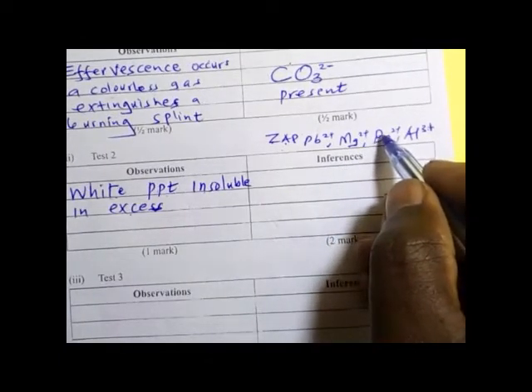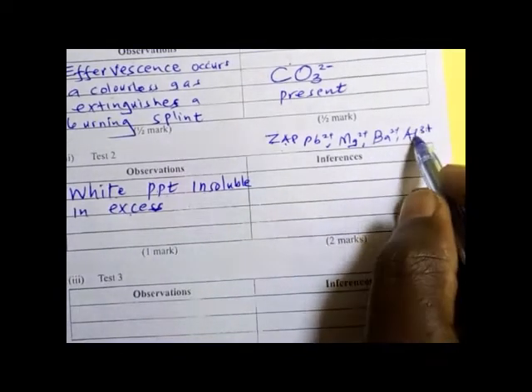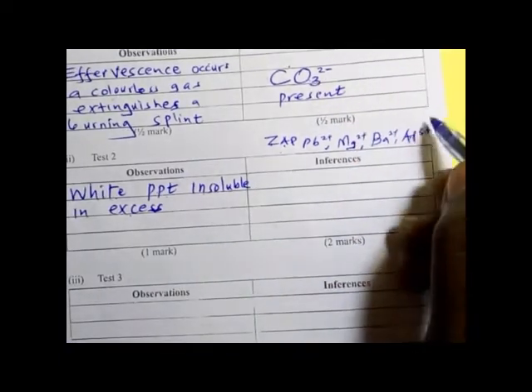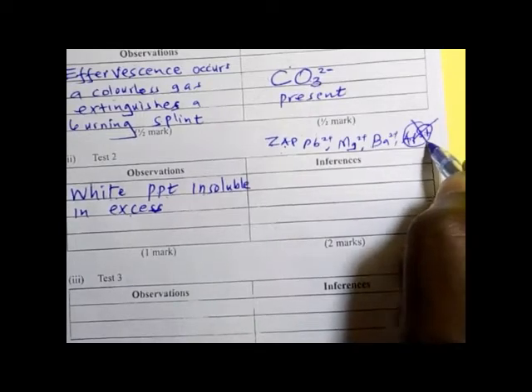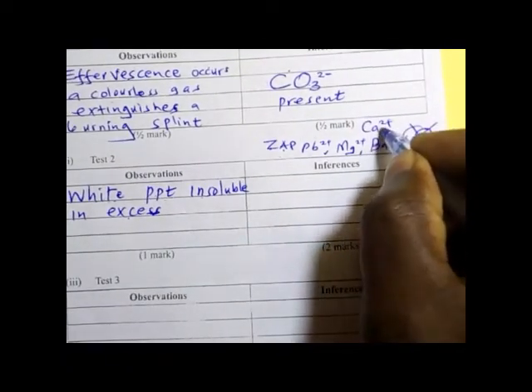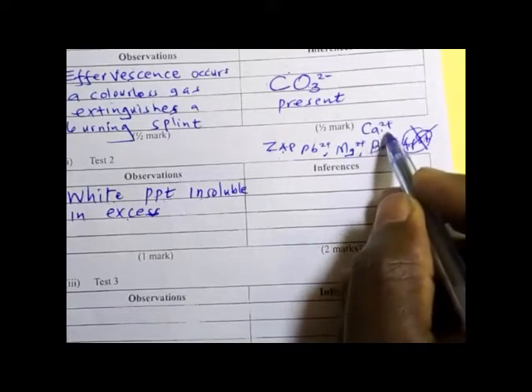Remember, I'm not going to allow aluminium, because we have said that carbonate is there, and aluminium carbonate does not exist. Therefore, aluminium is taken out. Also, I'm leaving out calcium ions.